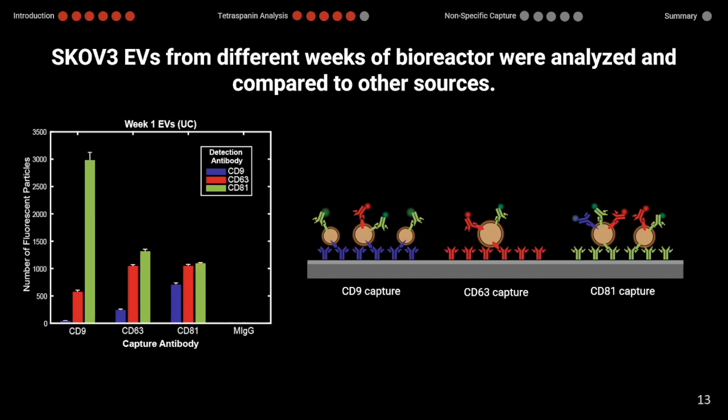There are lots of things that it can identify as particles. It just depends on where you choose your limits of detection. So had I chosen a slightly lower limit of detection, we would have seen more of a peak in our negative control.